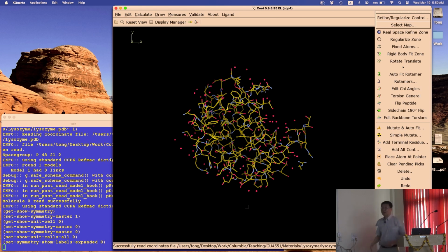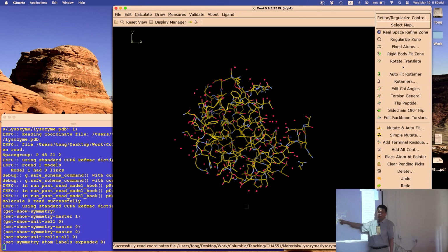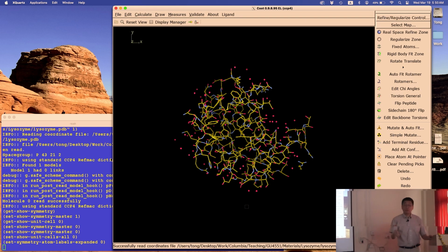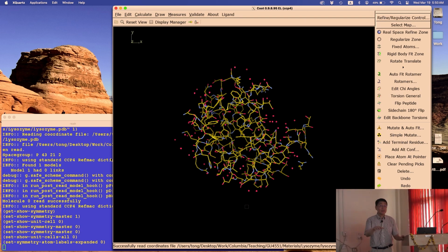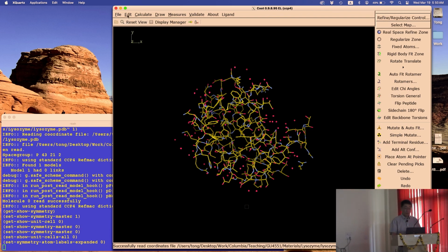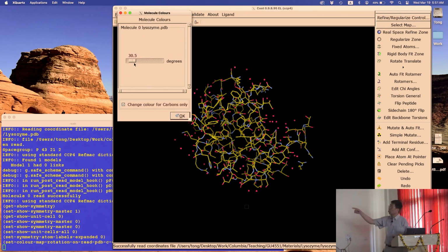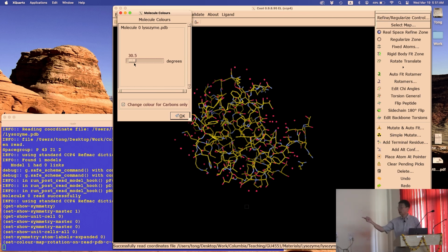Okay, now let's play with colors. Let's change the color of these things. Are you paying attention to me? If you're not with me, please speak up so we'll wait for you. I don't want you to fall behind. All right, so to change the color, Edit, Bond Colors at the very top. And then change the scroll bar to 0. That makes the carbon orange.